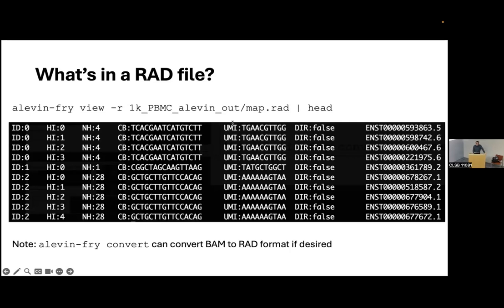Often we have some information from the lab that processed the sample going into the 10x machine, and they will have a pretty good estimate, like we expect, I don't know, 5,000 cells or 8,000 cells or something. I would give that number here, and then you can specify it for every sample in your experiment.